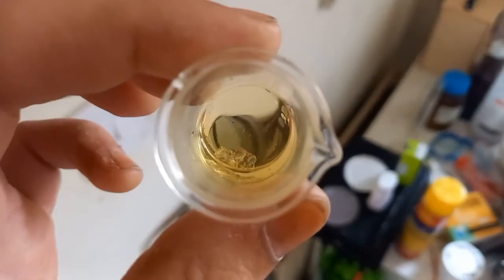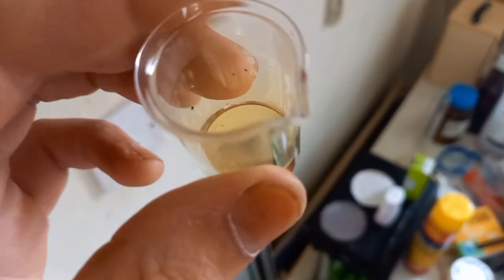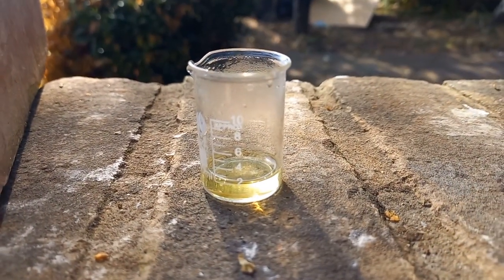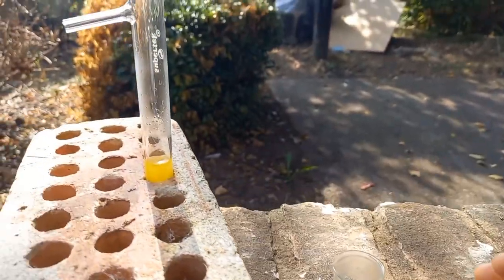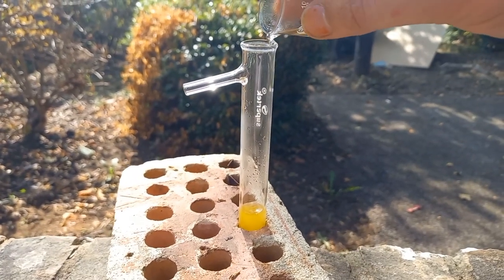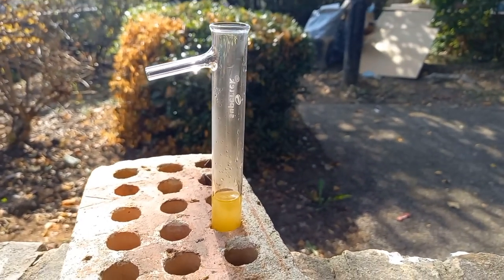Here is some bismuth nitrate in concentrated nitric acid. Hopefully it will dissolve without hydrolyzing — bismuth vanadate, here we come. Nope.